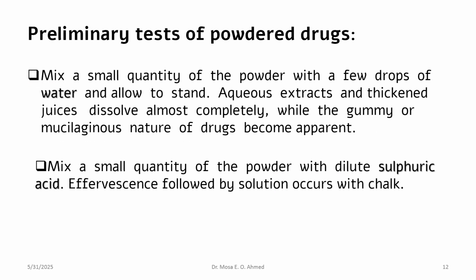We have another preliminary test for powdered and unorganized drugs, because they may be toxic, too pungent, or harmful to be tasted. We have other means to detect the identity of the powder sample.